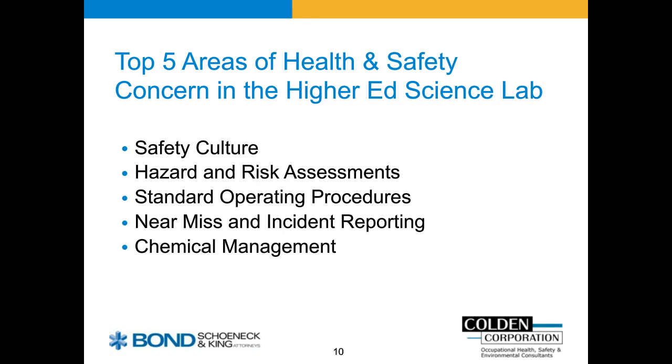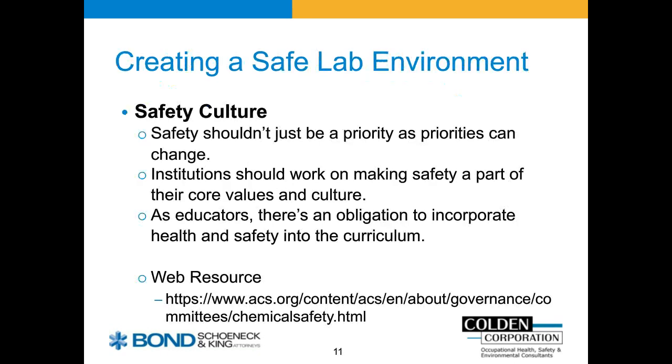And I'll share some more thoughts on that in a minute. And then I want to talk about the hazard and risk assessment process and how important that is and how it marries so nicely with standard operating procedures, really getting those written up and functioning. I'll touch on the importance of a near miss and an incident reporting system, and I'll finish up with chemical management strategies as a really important compliance nugget, and that'll marry nicely with what Barry's got on the dock.